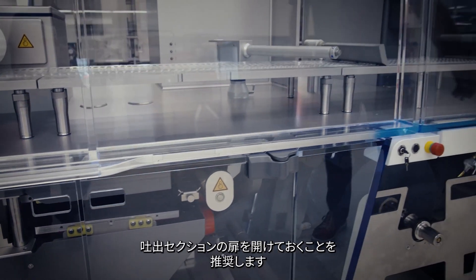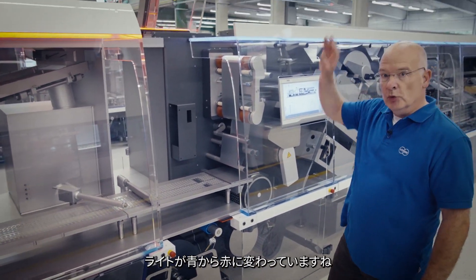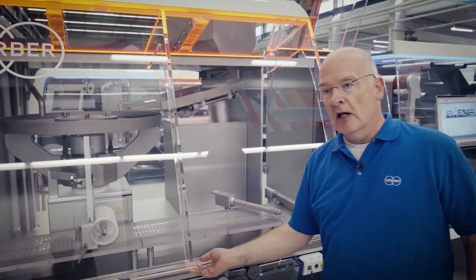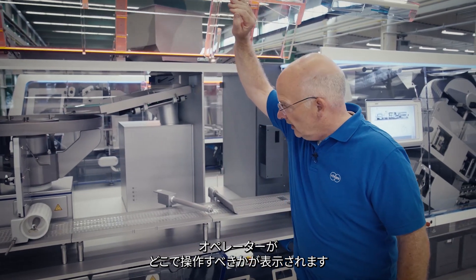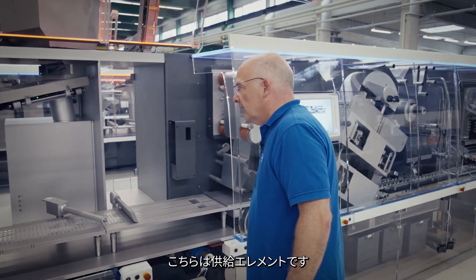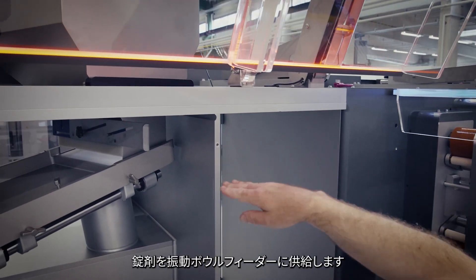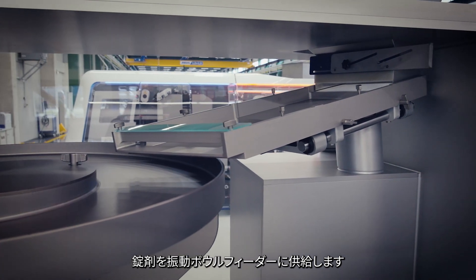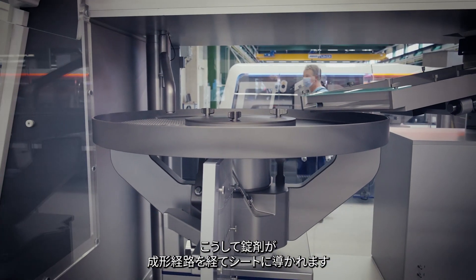If we open the door in the dosing section, you will see the light has changed from blue to red. This is a status light throughout the entire length of the machine — per every zone the operator gets indication where to act. The product hopper takes a reservoir of tablets and then spreads them over a seeding mechanism into the vibrating bowl feeder, where the tablets via format are guided into the web.